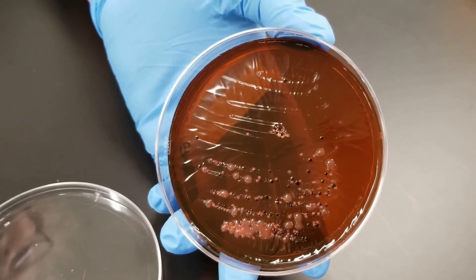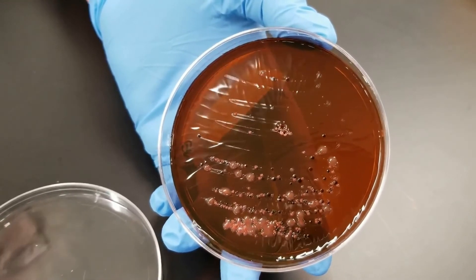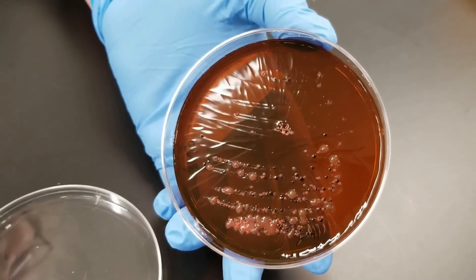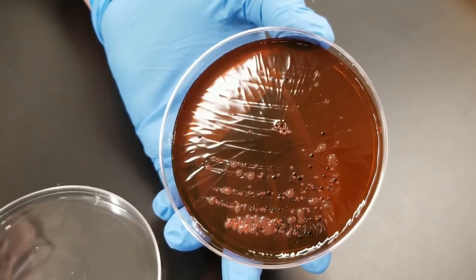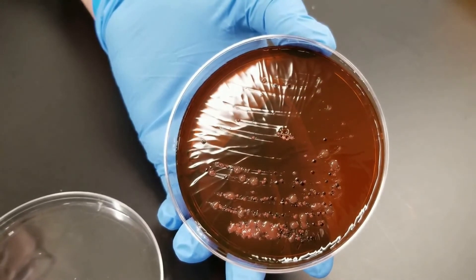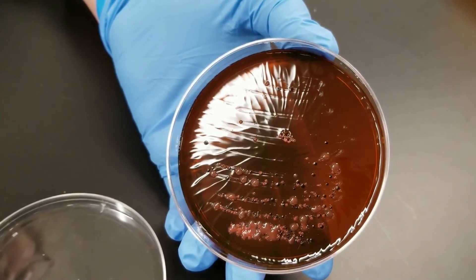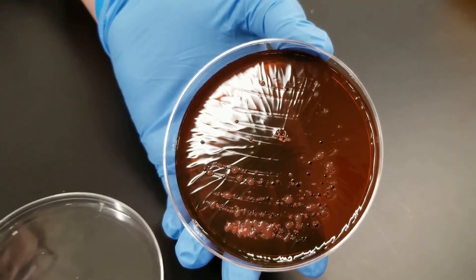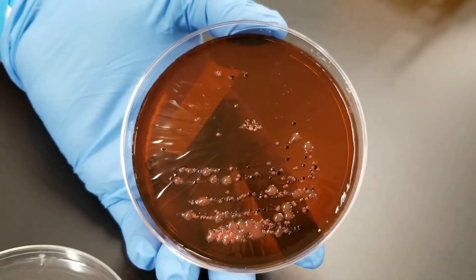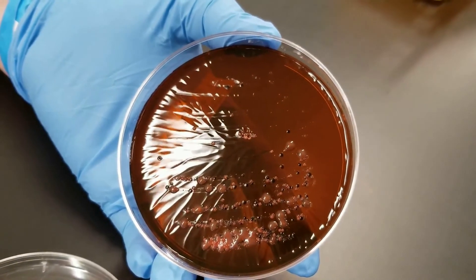You can tell just by looking at it that there are several different types of bacteria, which is not surprising because it was a soil sample. This is a good example of a mixed culture — you can tell different colony characteristics and different pigmentations. Some are larger than others, some are light pink, there's a very dark colored beige, and dark pink in there. As I said, it's a mixed culture.